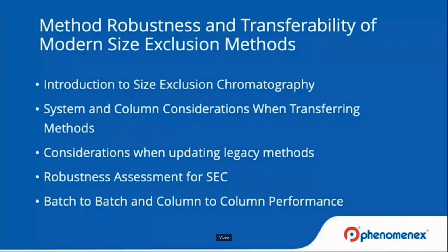Aggregate analysis is a critical and necessary component for proper characterization of biotherapeutics. While there are several different approaches to examining aggregates and fragments, size exclusion chromatography is likely the most utilized. This is in part due to its relative simplicity, reproducibility, and ease of transferability.